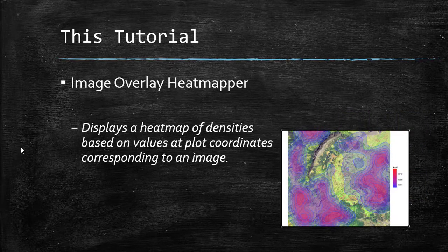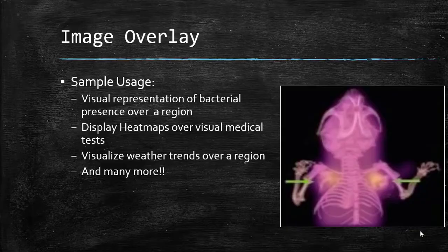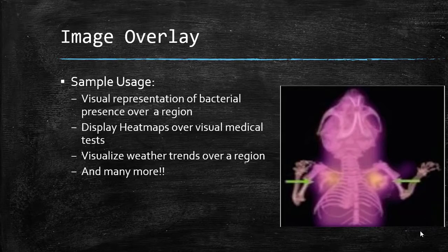This function displays a heatmap over an image and can be used for a wide variety of applications. For example, it can be used to create a custom heatmap of measured bacterial presence or abundance in different parts of the body, or to overlay x-rays over CT scans and other such tests. It can even be used to find weather trends over a region.